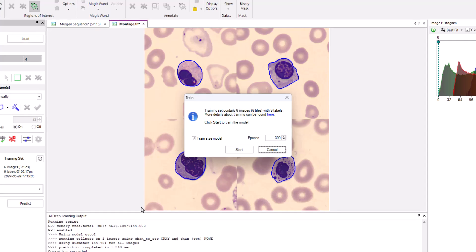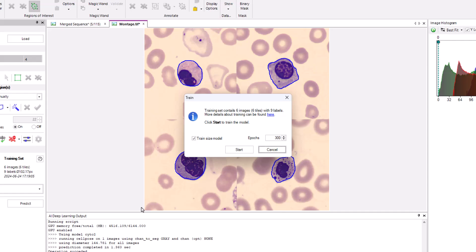After clicking the Train button, the Train dialog is displayed. In this dialog, I can choose whether to train a size model. This is a second model dedicated to estimating the size of objects of interest in the prediction panel, and to set the number of epochs. An epoch occurs every time the model sees all of the training data. In my case, I'm going to keep the option selected to train the size model and use the default number of epochs for training, 300.